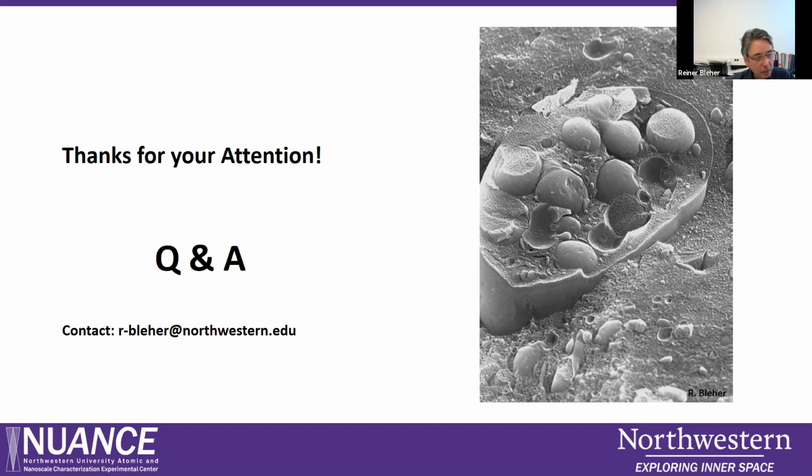If someone wants to look at very difficult to retain structures, of course, it's clear we have to freeze the sample. And if the sample exceeds a certain thickness, then we have no choice. We have to do high pressure freezing. An option would be to try cryoprotectants, but they often influence the sample also, of course. So it really always depends.